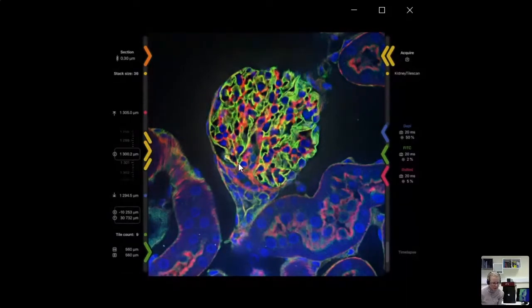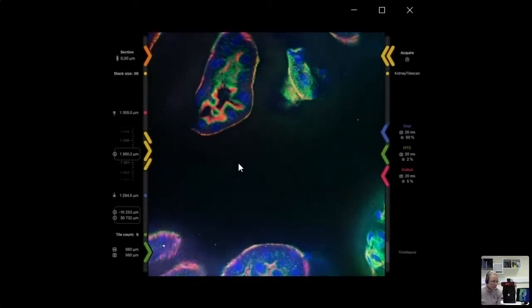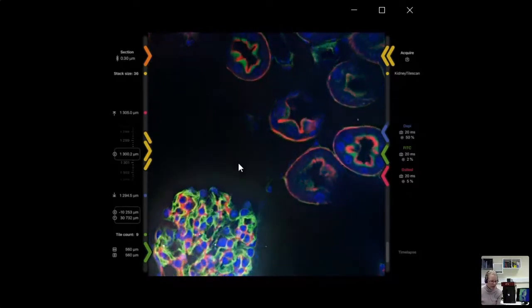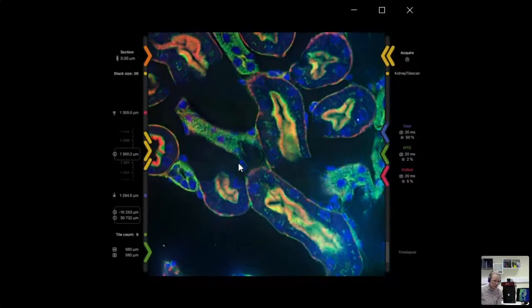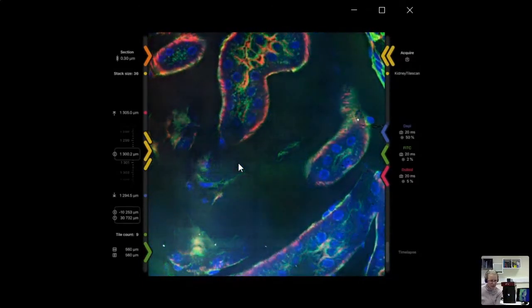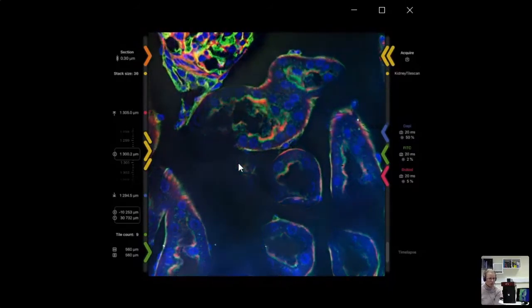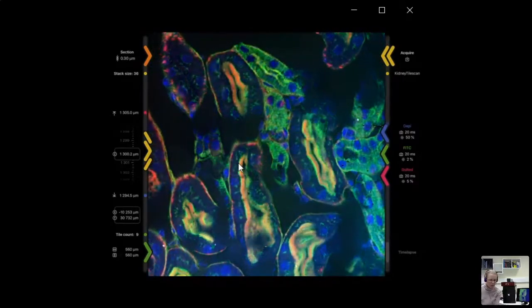You'll see the little yellow chevrons at the top on the right move as you swipe across the screen. You can see how quickly this system acquires data. What we're doing is strobing the LED light source really fast - blue, green, red, blue, green, red - while moving the Z drive. This means we can capture data in a really fast and efficient way, doing big Z-stacks or large tile scans very quickly. It's really well set up for screening exercises, big areas of tissue, or screening lots of cells, giving you lots of statistical data.